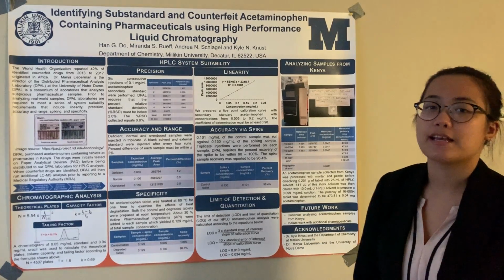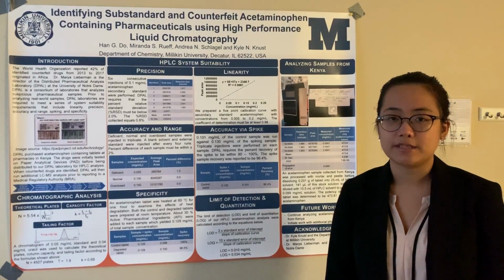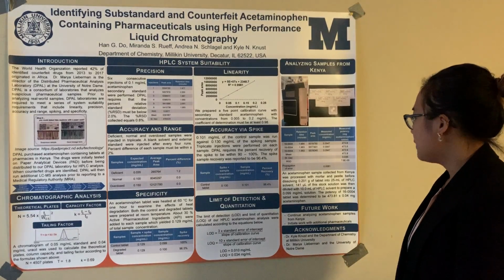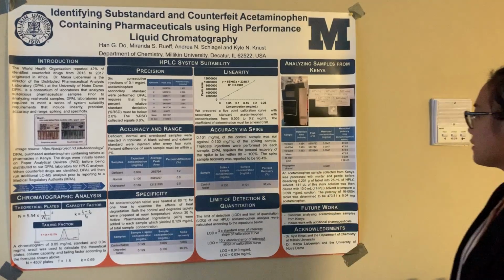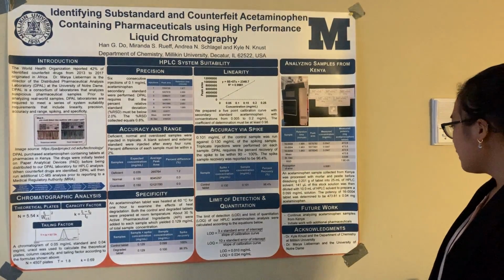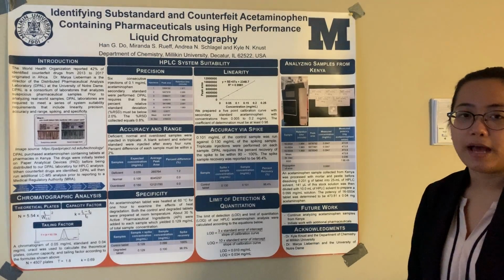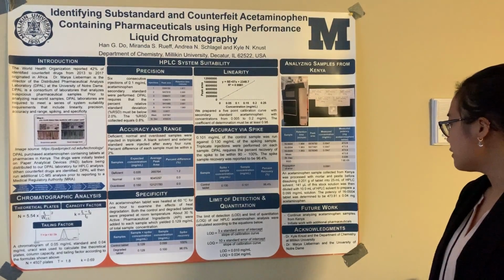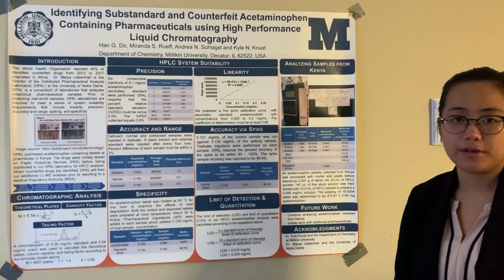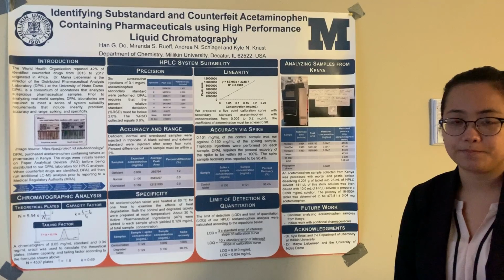Last year, DPAL sent us 5 different acetaminophen tablets from Kenya. So I processed the first tablet, having the sample ID of 160004. I processed the tablet in a mortar and pestle. Then I took 0.201 gram of tablet to dissolve in 25 milliliters of HPLC solvent.